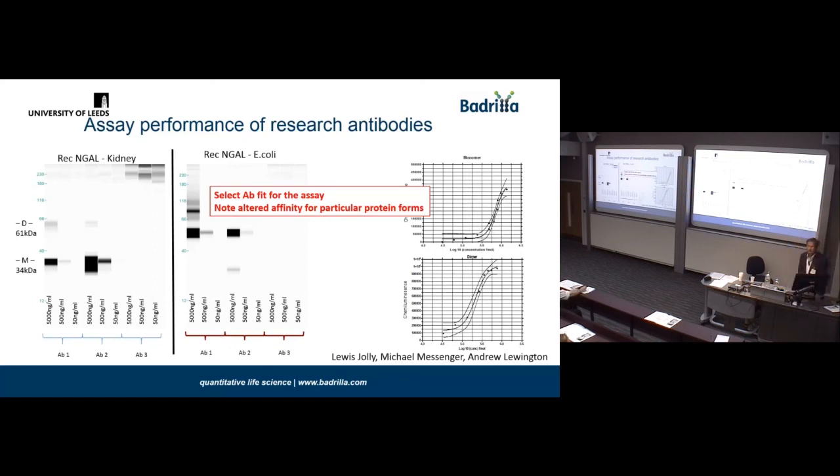I had a question about your earlier slide where you mentioned that you got 3 out of 5 positive results by your SRM mass spec assay. Could you comment on why that might be, that you weren't able to do 5 out of 5? So the way that we designed it, wherever we could, we used empirically observed tryptic peptides, and therefore they were highly reliable. But that didn't cover all 5. So for some, we had to use algorithms that would predict whether or not there would be clean cleavage, no post-translational modification within the product, and that it is likely to fly. We didn't get it right.